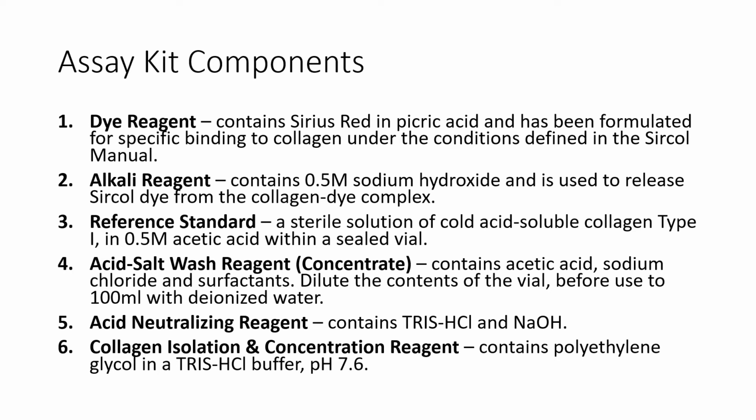The second thing is, for that absorbance to be converted into a collagen content, we would need a standard curve between absorbances and collagen of known concentrations. For that purpose, we have item number 3 here, the reference standard, which allows us to dilute it and build a plot of absorbances with known collagen concentrations.